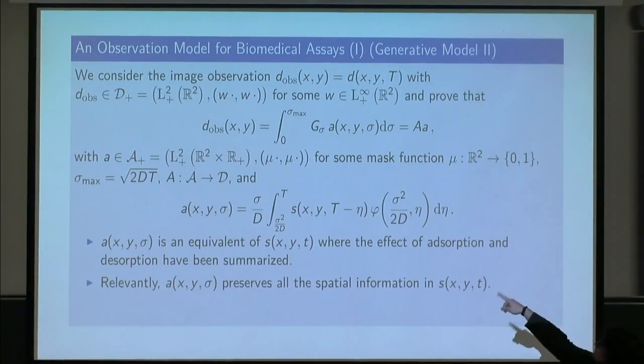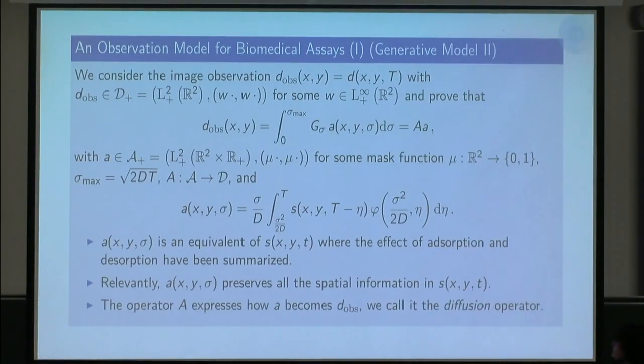And it will also have a masking function for us to be able to precondition the solution to the inverse problem, saying here you cannot place active cells. So this operator A popped out from this new expression, and because of what it does, we will call it the diffusion operator.